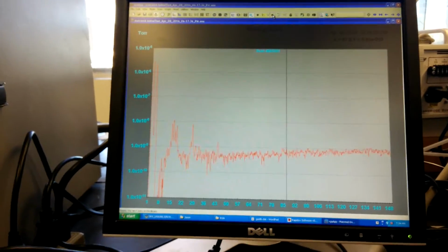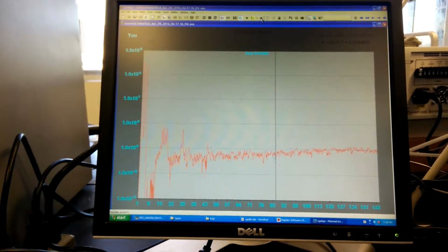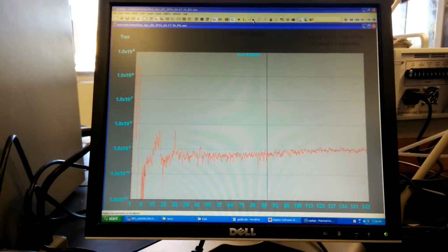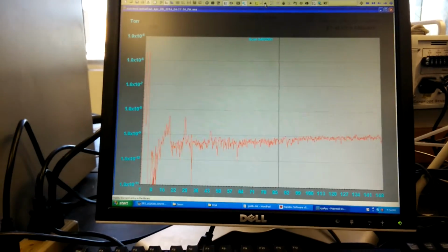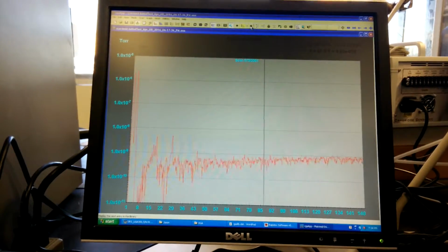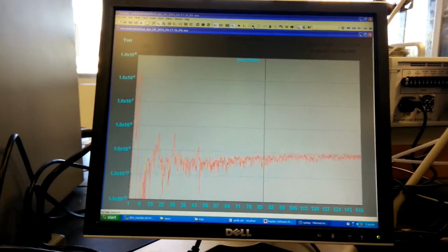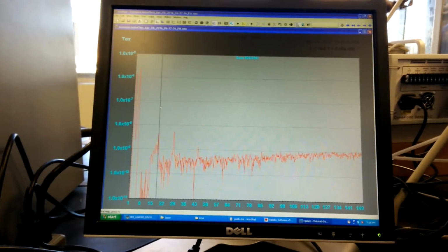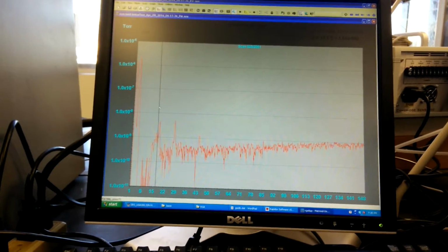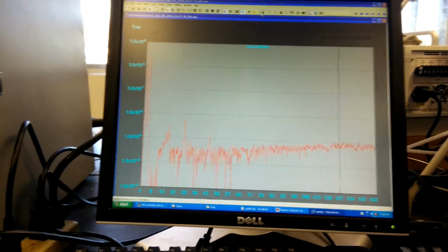So as we hit over 800 degrees, similar to the 6FDA-BPDA-DAM, we're seeing similar ratios of CO and methane, and we're seeing actually more hydrogen gas than helium right now, which is interesting, which means a massive amount of hydrogen is coming off. There is still a decent bit of water coming off, but the methane peak has definitely reduced significantly. There's still a decent amount of hydrogen cyanide gas coming off too.